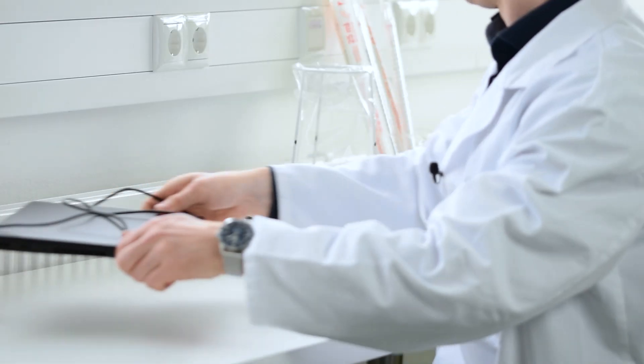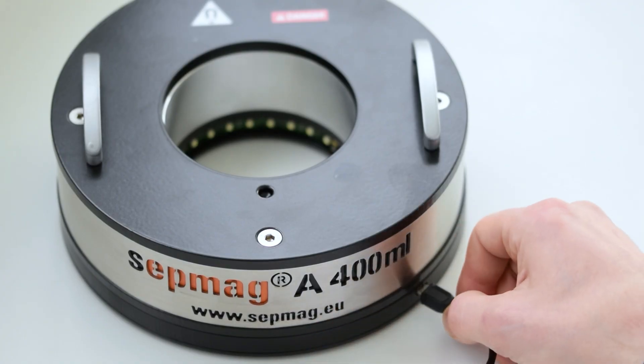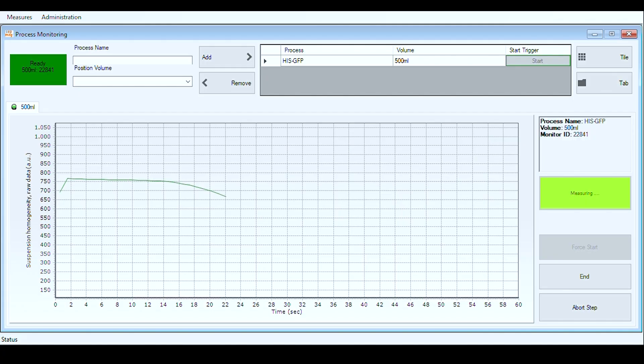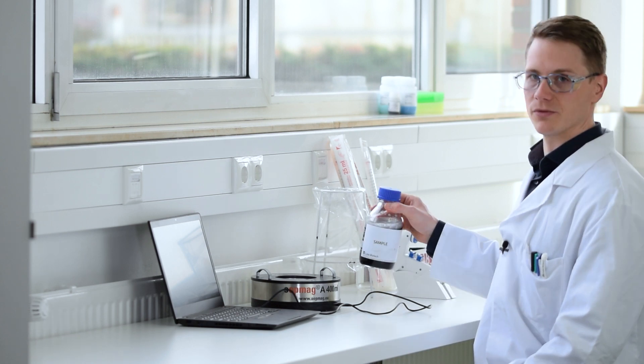Therefore, we will use the ZEPMAC A400. Due to a LED light source as well as sensors at the bottom of the ZEPMAC A400, the separation process itself can be monitored in real time. This allows you to objectively determine the separation time and losses of beads during the separation process, and guarantees an efficient purification of the protein of interest. It is therefore ideal for QM certified labs. This ZEPMAC system can handle sample sizes of up to 400 milliliters and you can work with a wide range of tube or flask sizes.